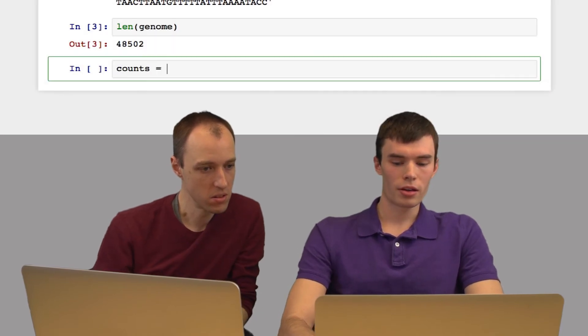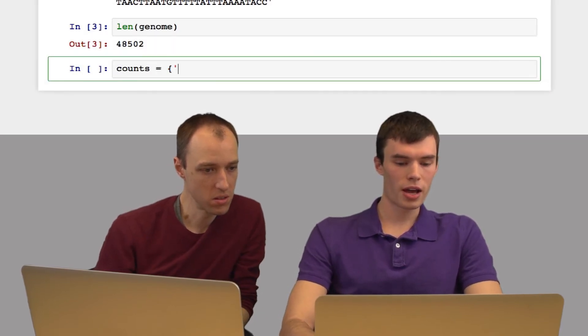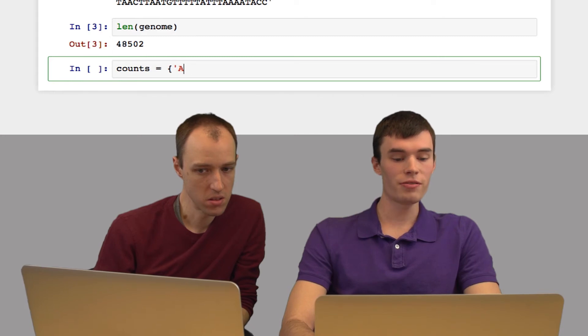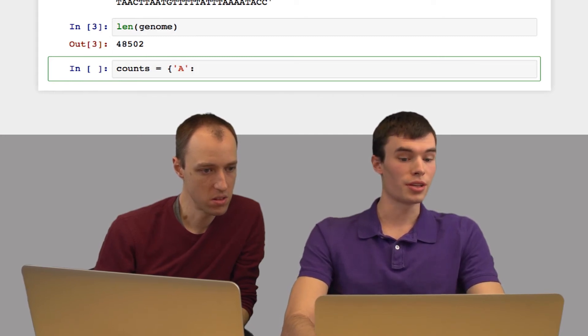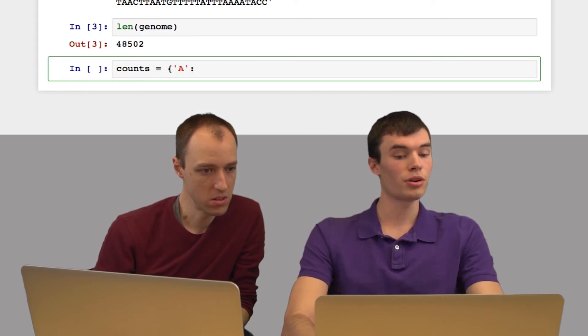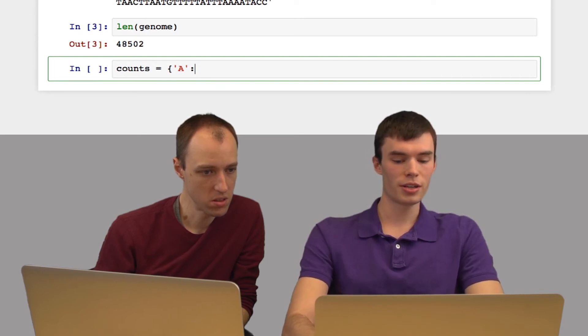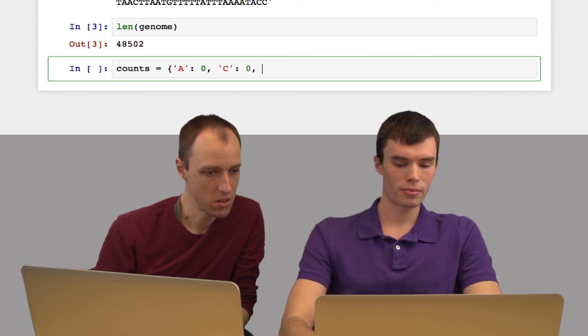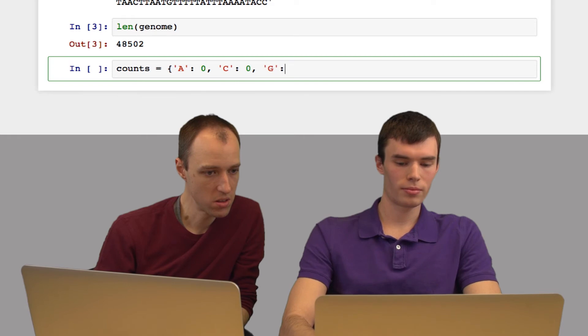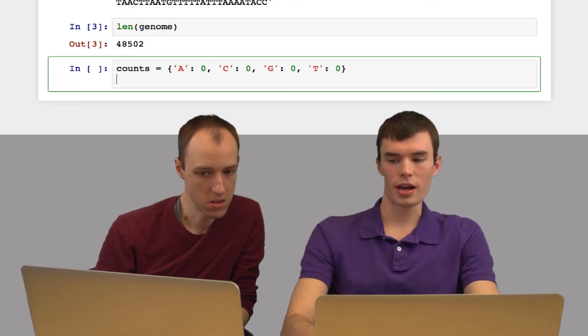Okay, cool. Now that we have this stored, let's do some analysis of it. Let's count the frequency of each base. So I'm going to do this using a dictionary. I'm going to have a key for each base and a value for the frequency, the number of times that base occurs. So I'll initialize each frequency to zero.